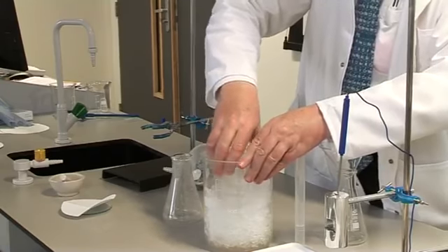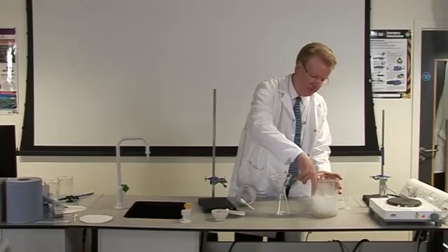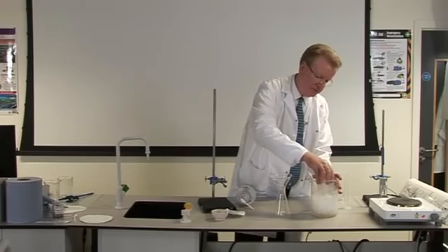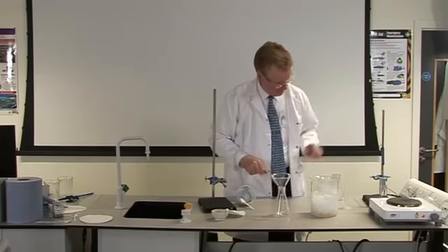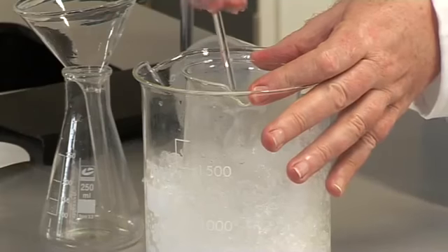On allowing the hot solution to cool, crystallization takes place and crystals of pure benzoic acid are formed. If these crystals are slow to form, scratching the inside of the beaker with a glass rod speeds up the crystallization process.